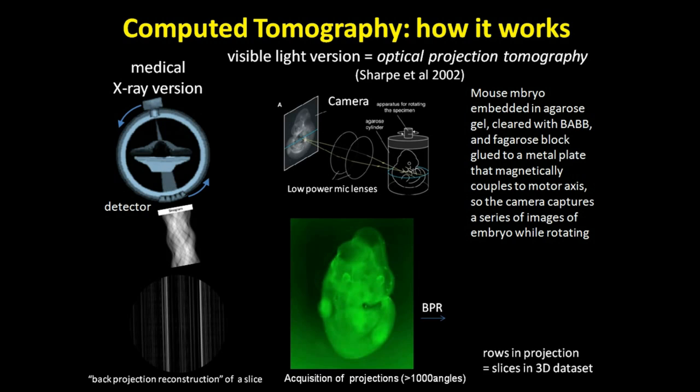Now, that's really not true of visible light, the light we see with our eyes. Not that we are very opaque, it's just that there's a lot of scattering that goes on as light traverses biological materials, and you basically lose the ability to see inside most biological tissues.